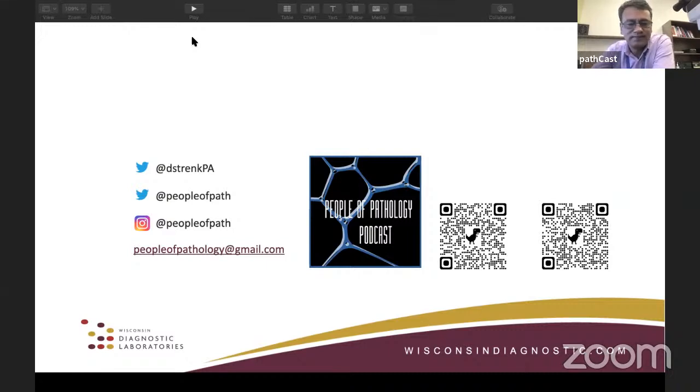Don't you agree? Yeah, I definitely agree. Yes. Right, because I have seen in some places that for tubular structures, I don't think that we should submit perpendicular margins, right?